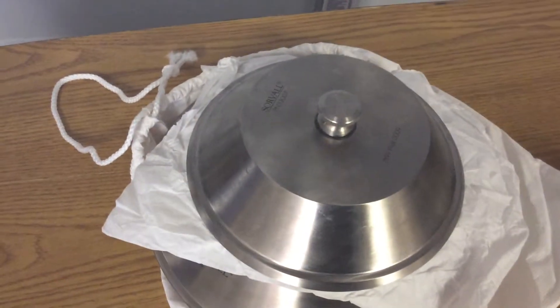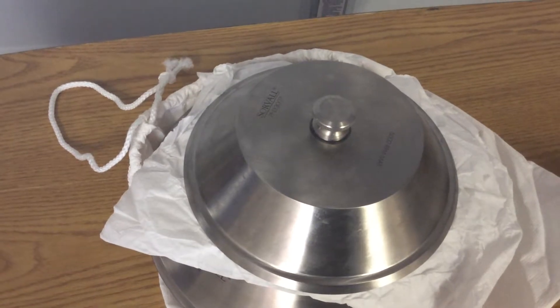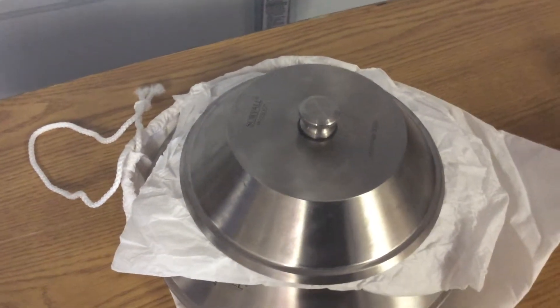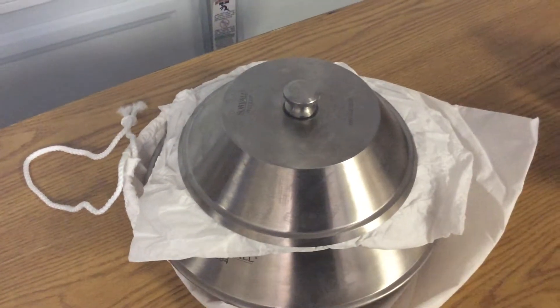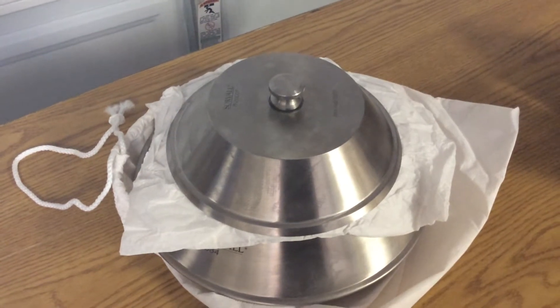The part number for the lid is 33007. This is a 24-place rotor for 16 milliliter tubes.